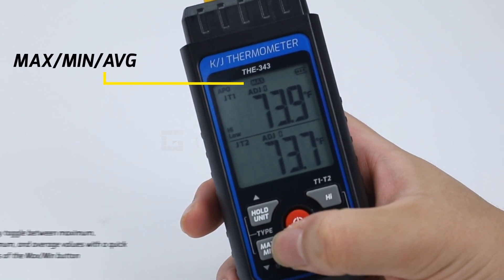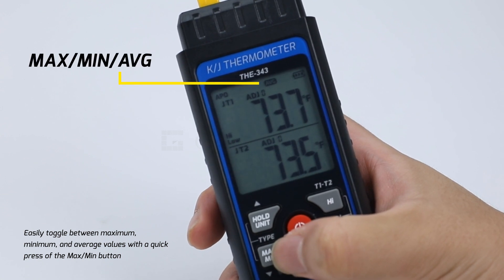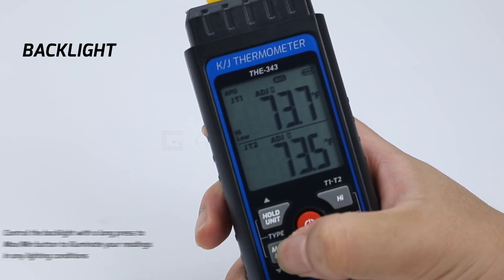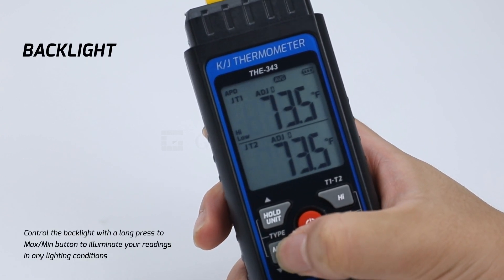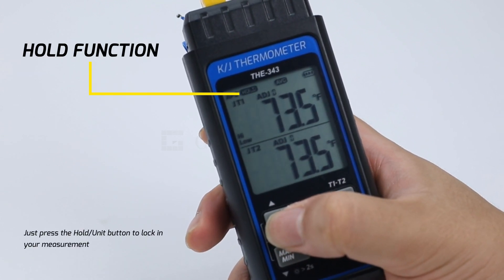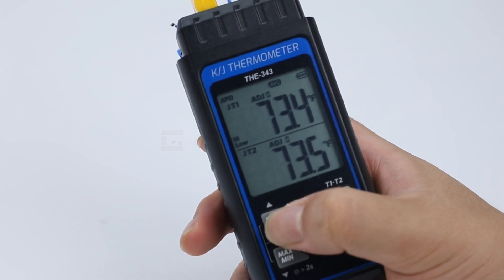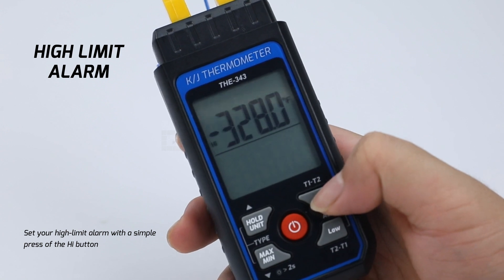Easily toggle between maximum, minimum, and average values with a quick press of the Max/Min button. Control the backlight with a long press to illuminate your readings in any lighting conditions. Just press the hold button to lock in your measurement. Change temperature units effortlessly by long pressing the hold button.